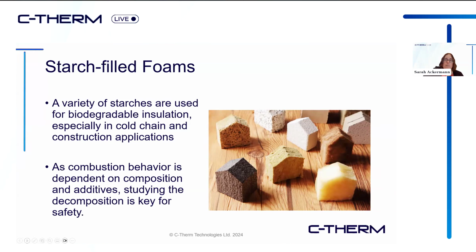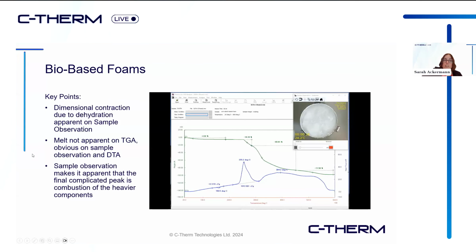Its porosity is going to be different. Its surface area to volume ratio is going to be different. And because of that, its behavior in thermal decomposition in either oxidating or inert atmosphere is going to be different as well. So we need to understand that from a safety perspective.